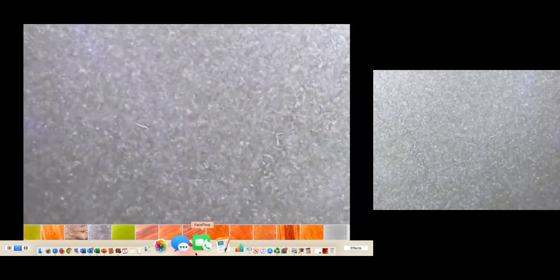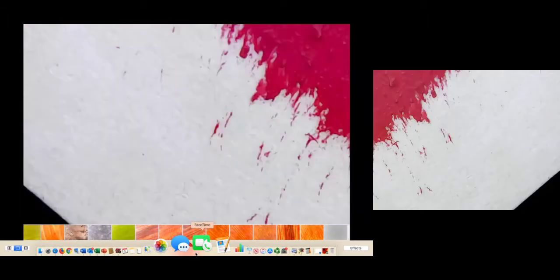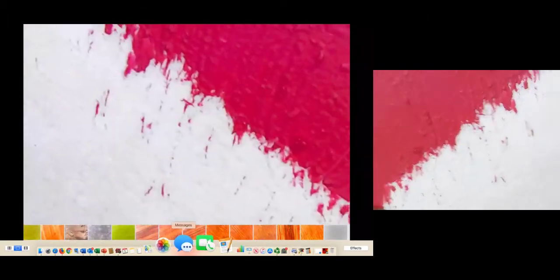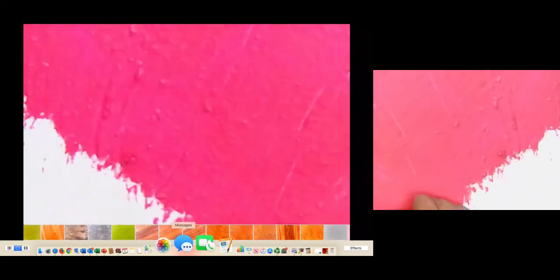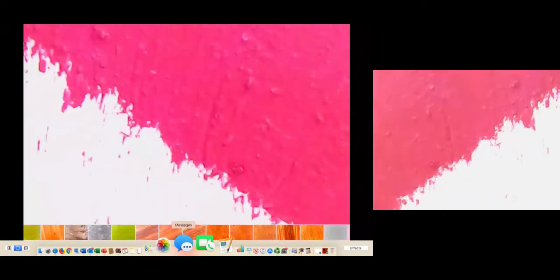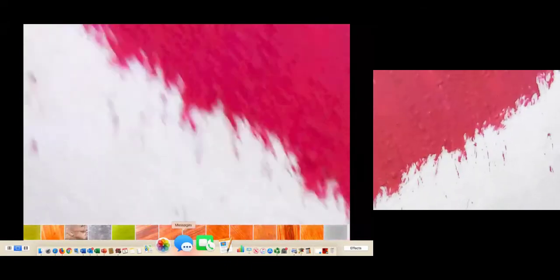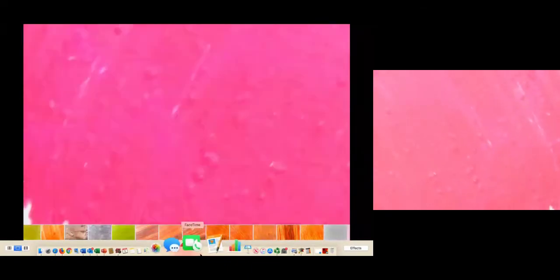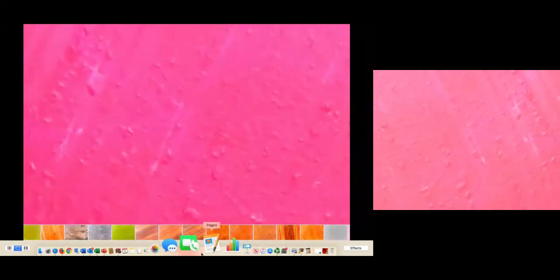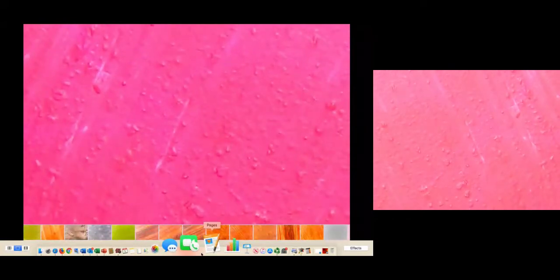And here's a sample that was prepared yesterday. And this one did not have any kaolin or material added. Now you see those particles, you might say what's causing that.